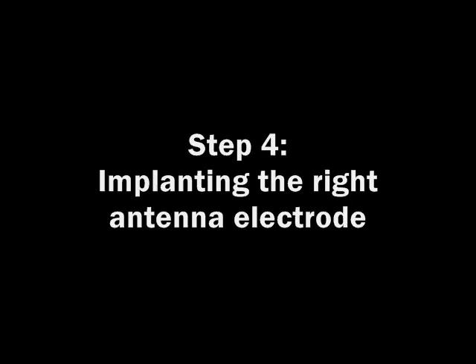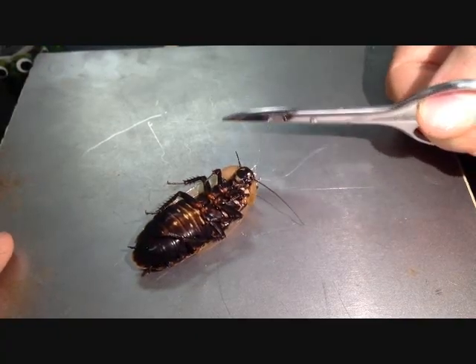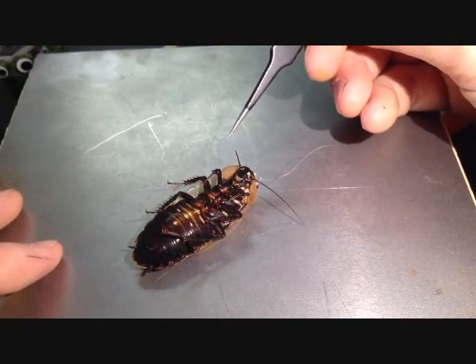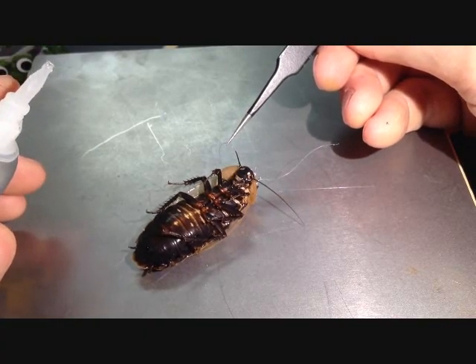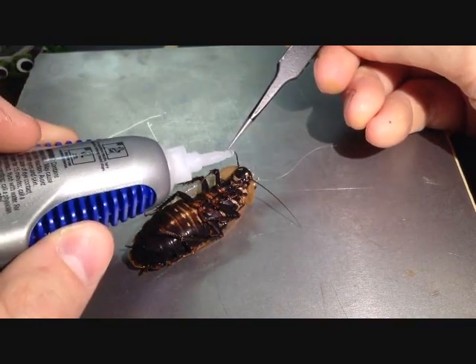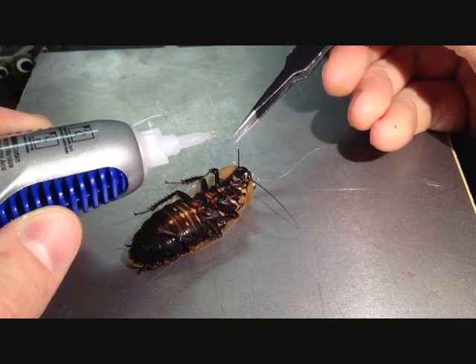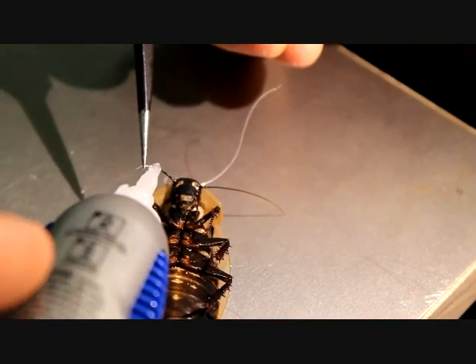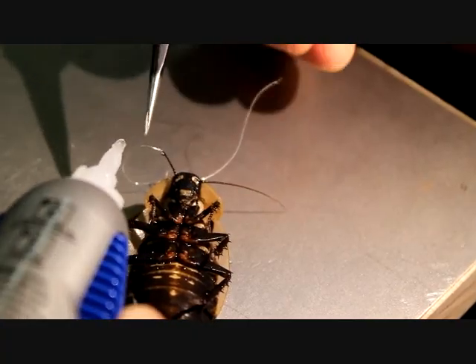Next we will implant the electrode into the cockroach's right antenna. Take the cockroach out of the ice water and lay it on its back. With dissection scissors, cut the cockroach's right antenna down to one-eighth to one-quarter inch long. The antennae of a cockroach are hollow, fluid-filled structures with a nerve running down the center. Grasping the right electrode with the forceps, park the exposed tip about one millimeter inside the right antenna. As you did earlier, dab a bead of superglue just above where the electrode is parked in the antenna, using a toothpick for easier application. Then use forceps to park the electrode such that the superglue bead partially enters into the antenna approximately two to four millimeters. Add a bit more superglue at the interface if needed, but avoid excess glue. When you are done, place the cockroach back into the ice bath for another one to two minutes to maintain the anesthesia.